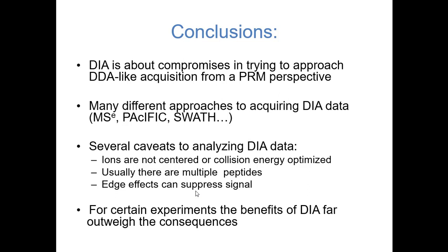Actually, the biggest weight for SSRCalc is the precursor mass. So you could do just as well if you lined up with precursor mass, basically pretty close to SSRCalc 3. I think that's true, actually. In our hands, prediction of the SSRCalc in our gradient was plus or minus a couple minutes. It was actually pretty accurate. How long was your gradient? 25 minutes or so. Okay, so yes. I'm talking about plus or minus 10% of the gradient.